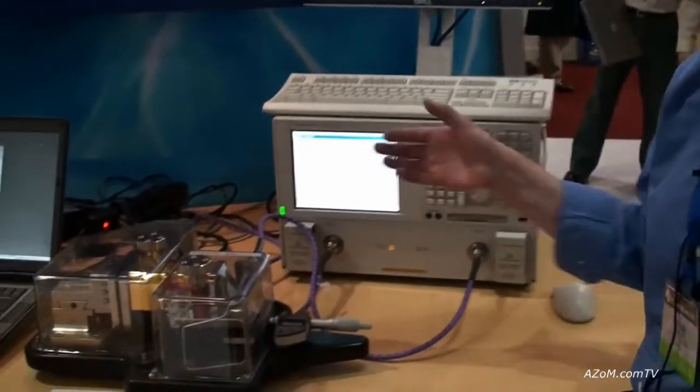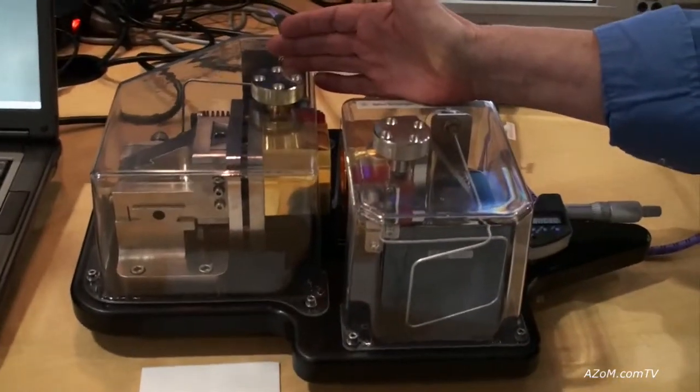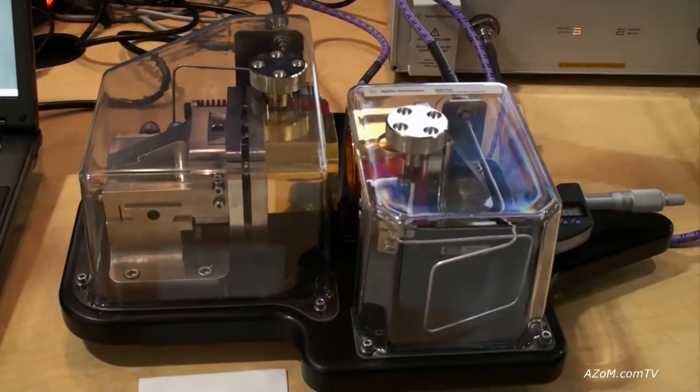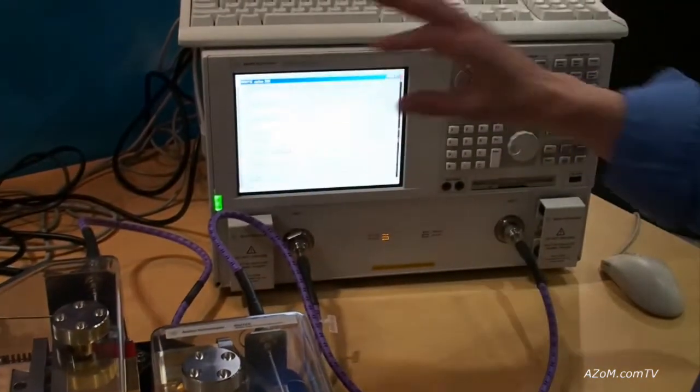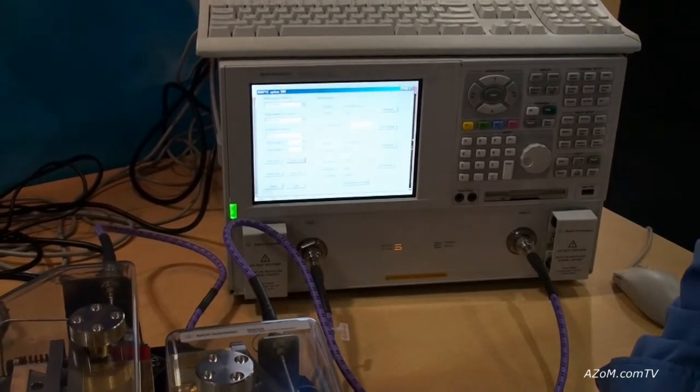So we have the system here, the split cylinder resonator, a network analyzer, and some software that we're running on the network analyzer to calculate the permittivity.